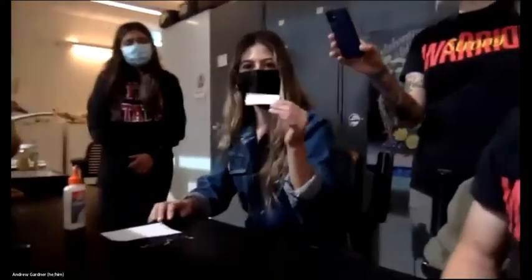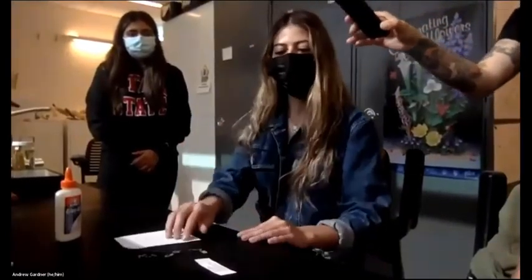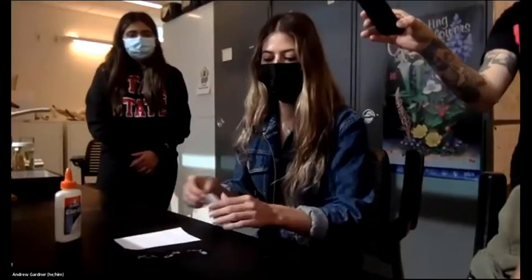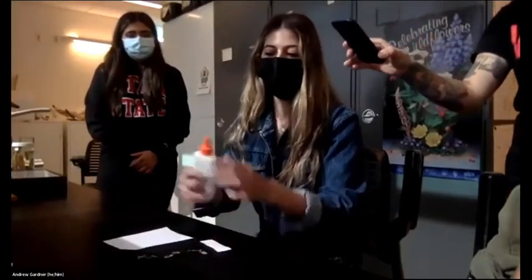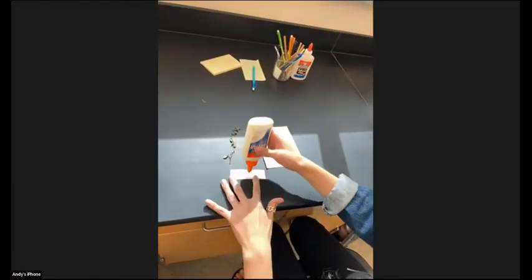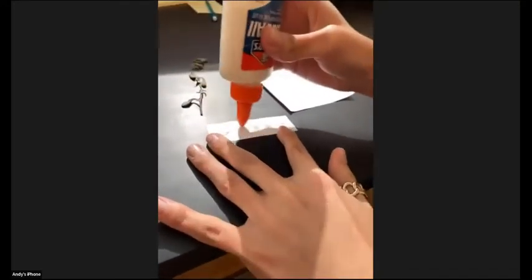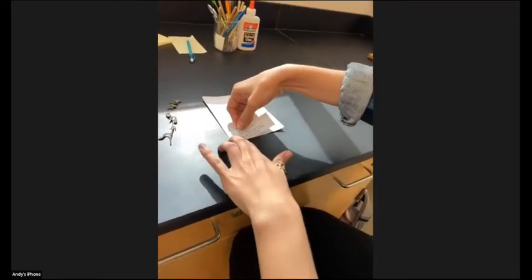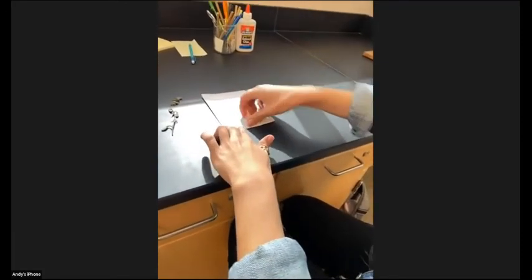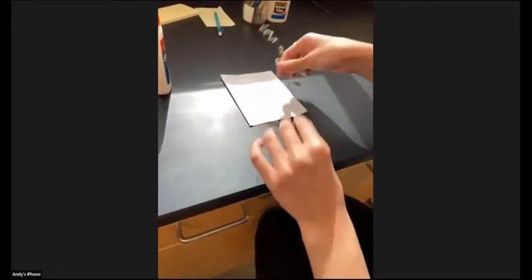Alrighty, so by now everyone should have a label, a specimen, and then a paper cutout where they will be gluing it. So first step, we're gonna go ahead and glue the label on one of the corners. And as Dr. Gardner said, we're gonna be using a small amount. You can do little dots of glue so that it can dry faster and not be so wet. And also we want to use the label first in case our specimen is a little bit larger. It is better for the specimen to overlap over the label.